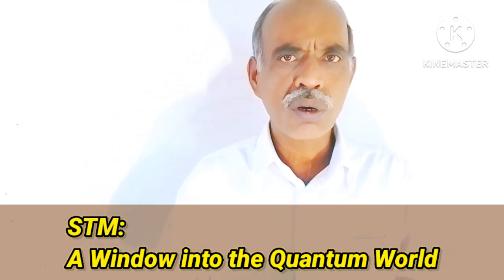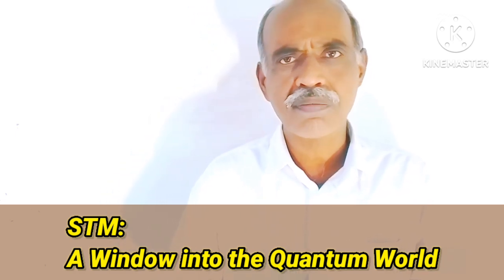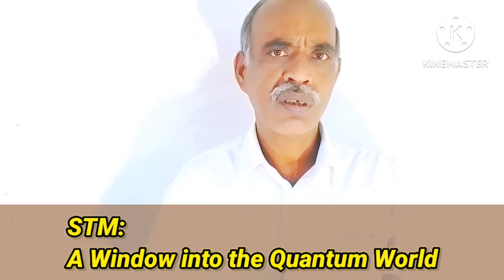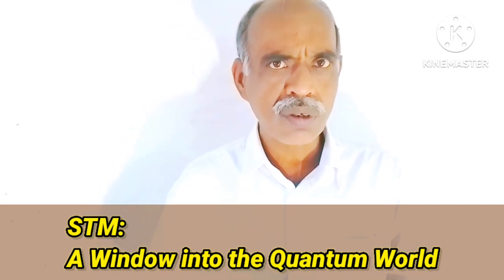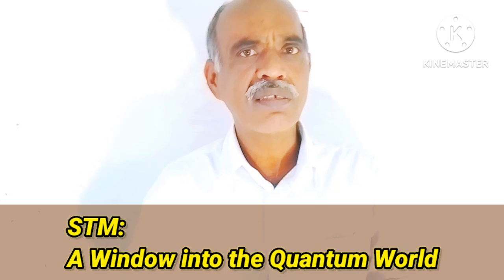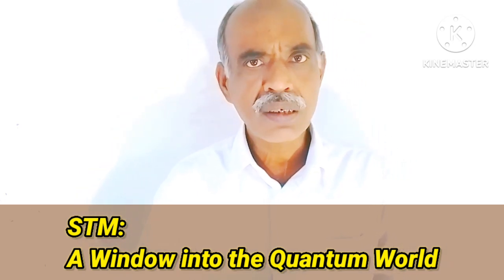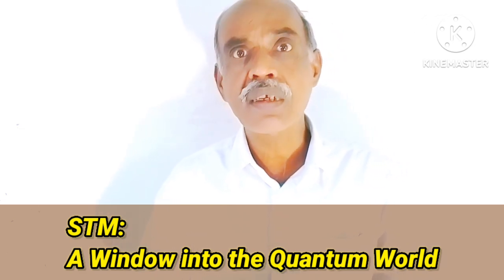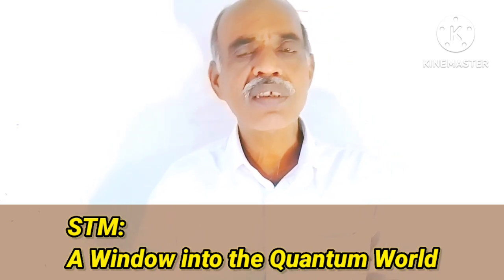Anyway, in this technology, in STM, the same principle, the quantum tunneling effect, is used. This microscope is used in the field of nanotechnology, which is a field of study. Again, this STM is used to study electron behavior in graphene and to study superconductivity.